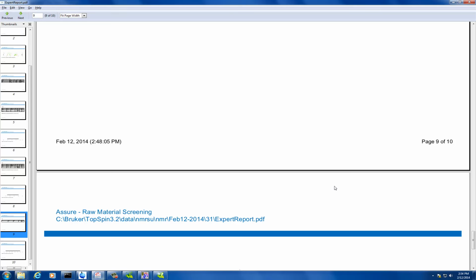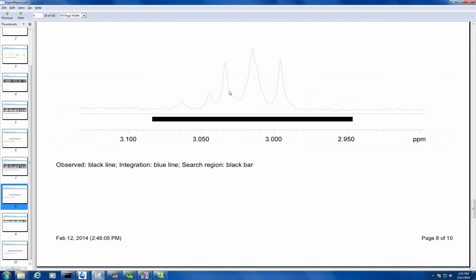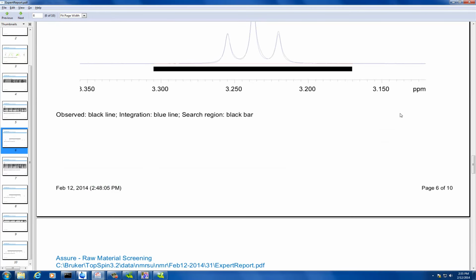How long can it last? For these, around 4 to 5 years because it's sealed. Do you blanket it with nitrogen and stuff like that? That is the procedure, but it's all done in Switzerland, and from Bruker they give you this sheet with all the different 6 significant digits, like this is how pure it is, and I'm like, okay, sure. So that's something to put in your budget, a reference standard. I know, I'm looking it up right now, to see if I can find one.